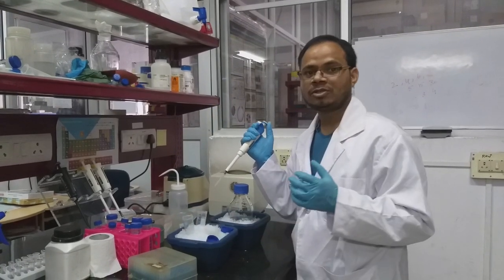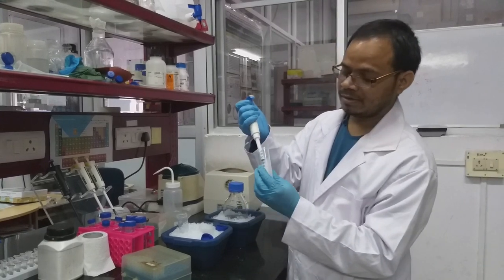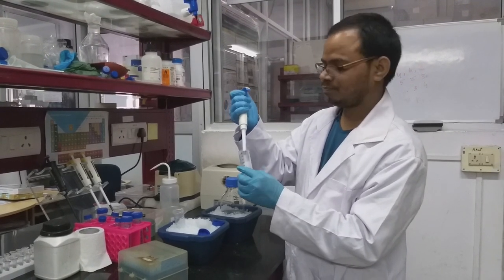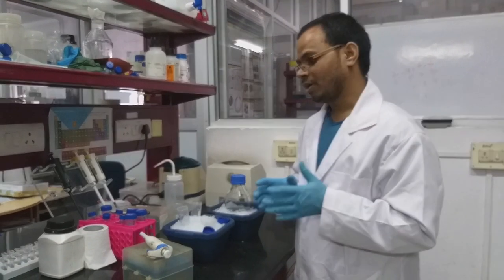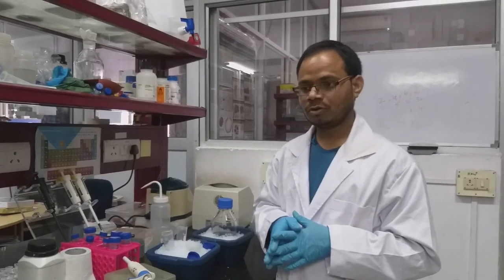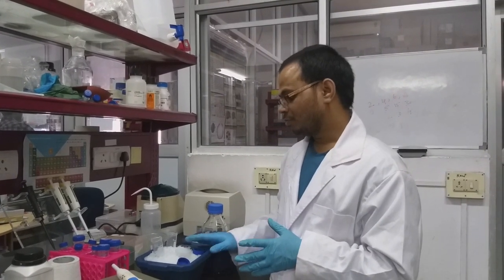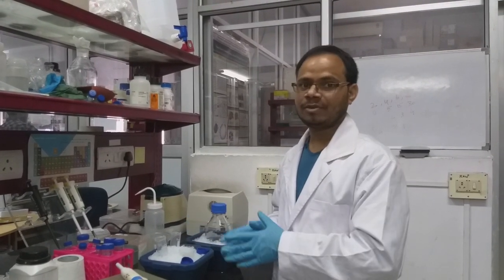So while doing this, make sure that there are no clumps in the cell pellet, and always keep it on ice. So why are we keeping it on ice? Here we have to remember, most of the proteins are heat sensitive. So to prevent degradation or dysfunction of the proteins, we'll use ice as a medium. If you keep it on ice, at least they will be stable.